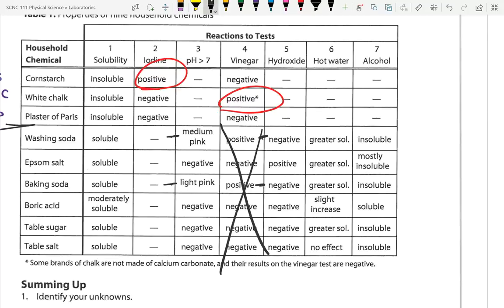Now this one here is a 1-to-5 ratio. This one here is really kind of a 1-to-5. So you say, what's the next test to take? Which one is going to have the biggest selectivity of the tests remaining? 3, 5, 6, or 7? Yeah, 3 has a 2-to-4. That's your biggest selectivity of these remaining tests. So you would do that one. So you'd have either one of these 2 or one of these 4.